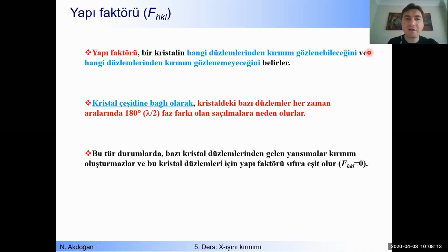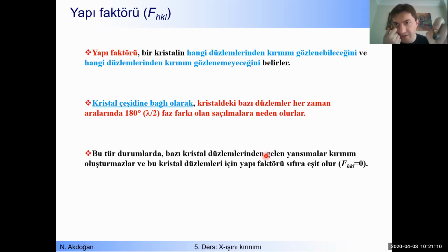Okay, so here I would like to talk about structure factor. So what is structure factor? Why is it useful? I will talk about this. Structure factor gives us information about the diffraction from which surfaces of the crystals, or which planes of the crystals. So normally, if you consider, for example, a cubic structure, let me draw here. Let's consider that here we have a cubic structure.